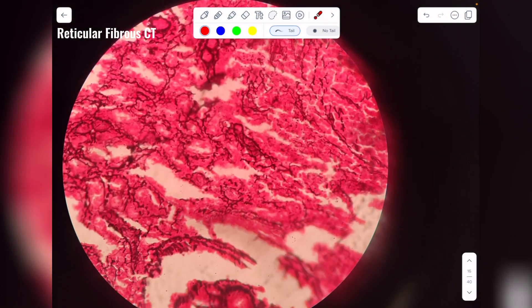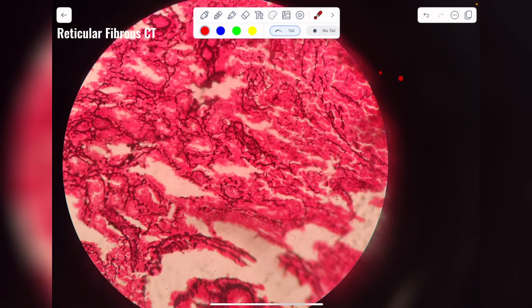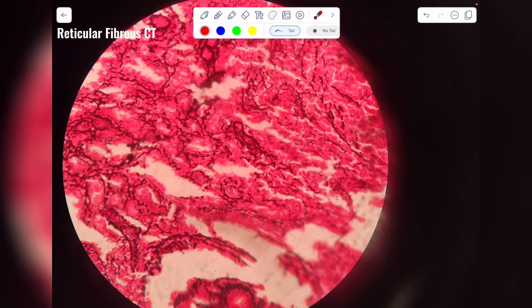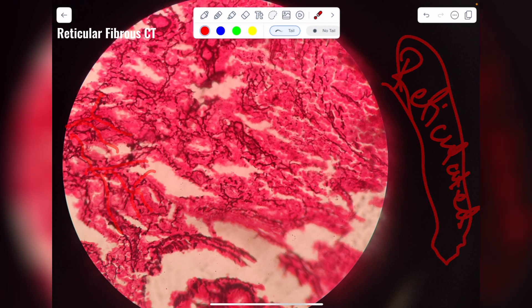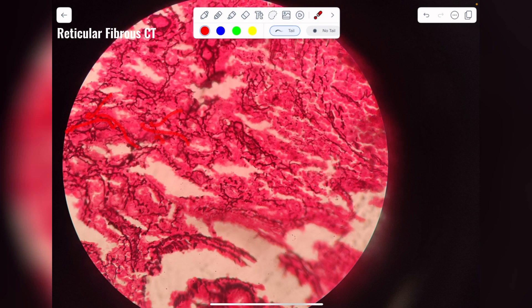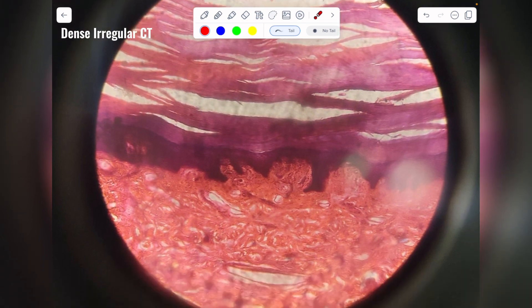Next are reticular fibers, which are made up of reticulin protein. These reticular fibers are arranged in irregular, highly branched patterns — they are reticulated, as the name suggests. This is your reticular fiber tissue.